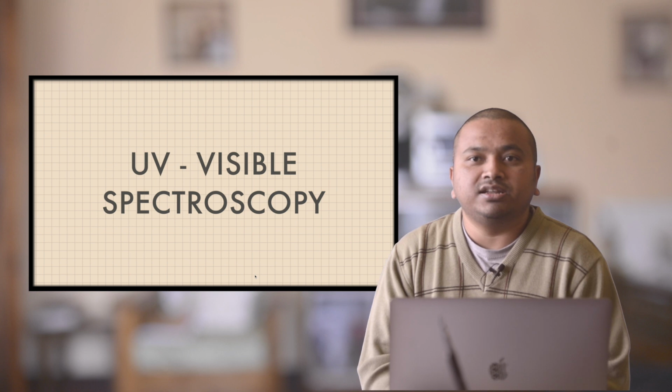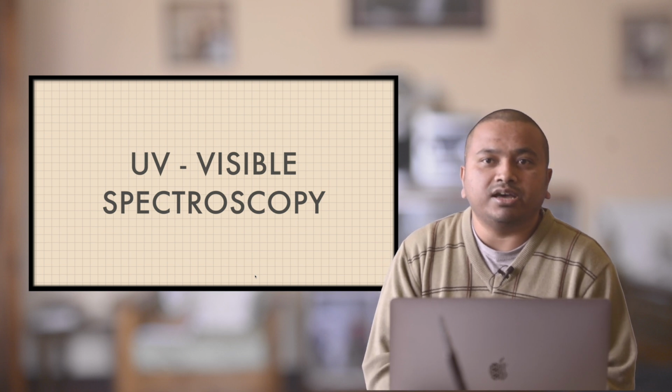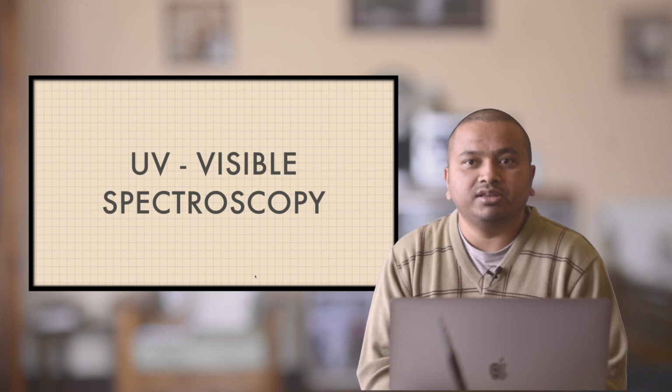In the last session, I've talked about absorption of electromagnetic radiation by molecules. Today we will have a look at the working principle of UV visible spectroscopy.